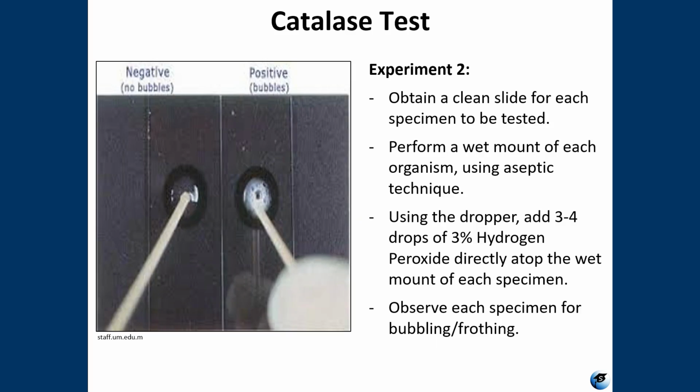For experiment 2, you're going to do it on a slide. You're going to obtain a clean slide. If you have fingerprints or smudges, you clean it with lens paper.